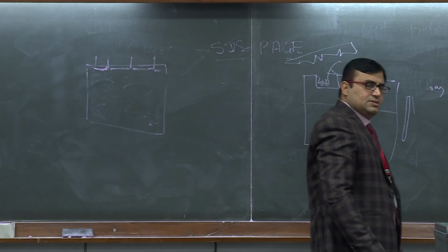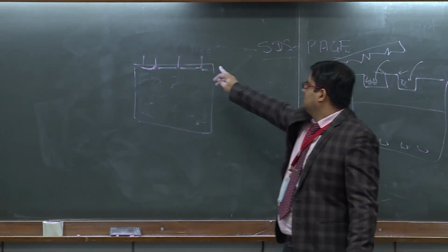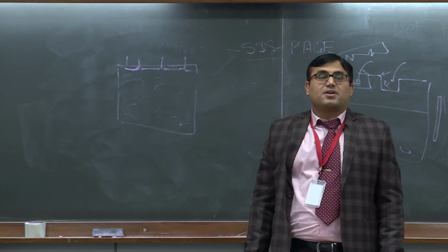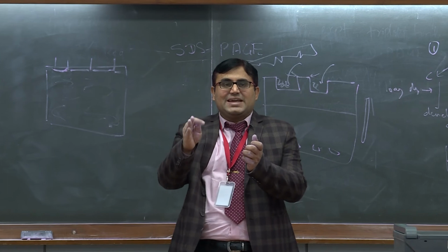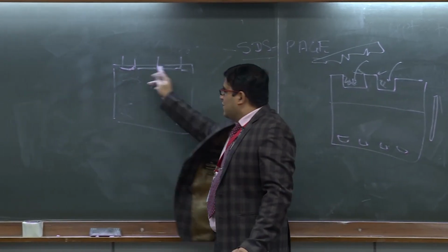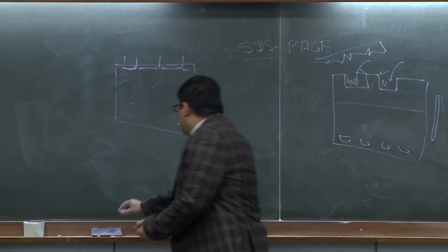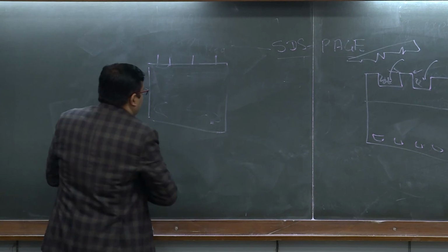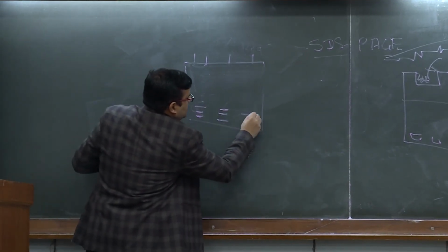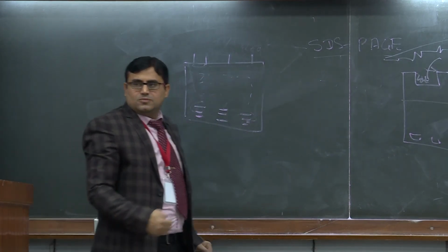What may be the reason? It means the transition which you have made between stacking and resolving is not perfect. That's why it's accumulated at the top itself. Many times you will get a result like this. What may be the reason?